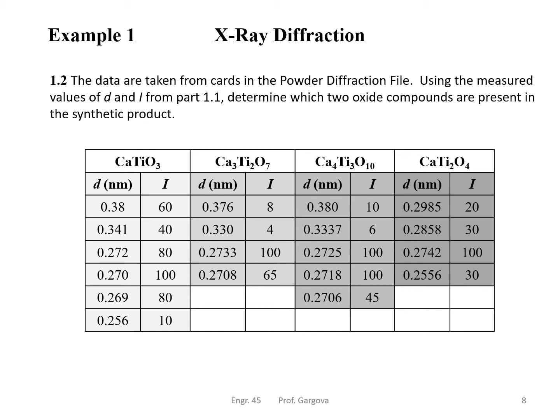I mean, 4 is even smaller. So relative to 100, it would be 4% of that 100. To make it easy, you would think of a peak of 1,000 as the 100 peak, and then a peak with a relative intensity of 4 would be basically 40.